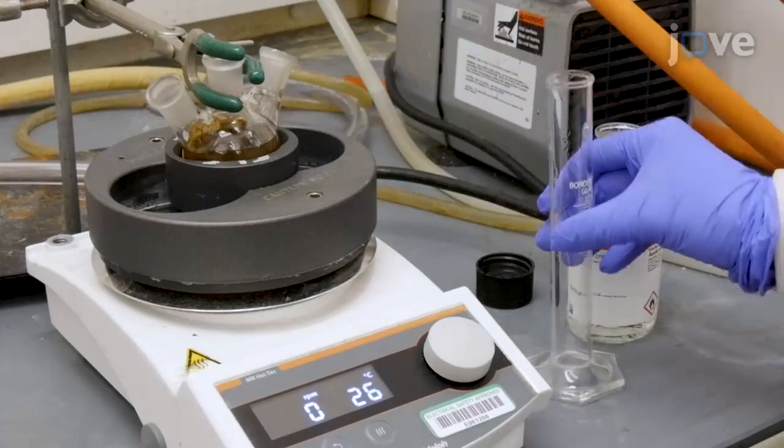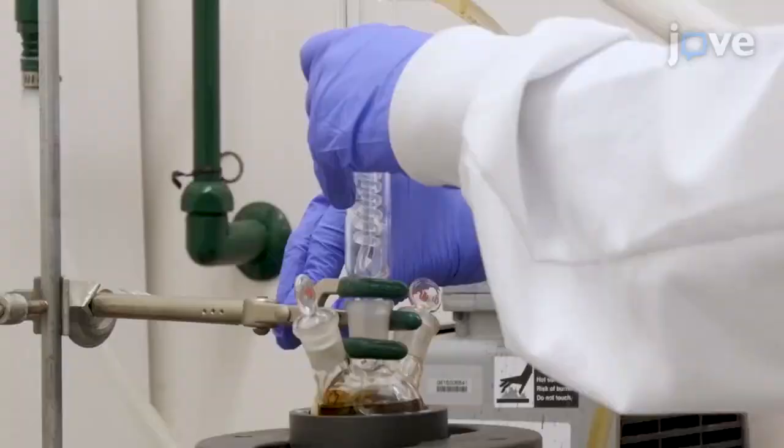Equip the flask with a condenser, stopper the other necks, and fix the flask in a heating insert on a stirring hot plate.